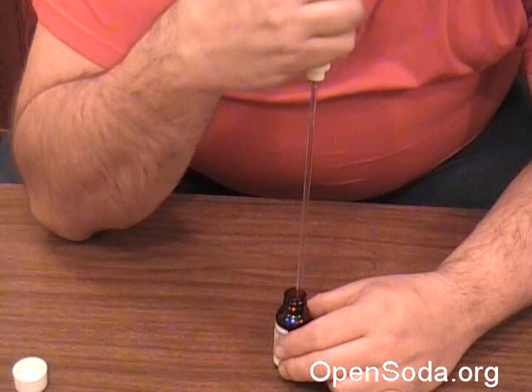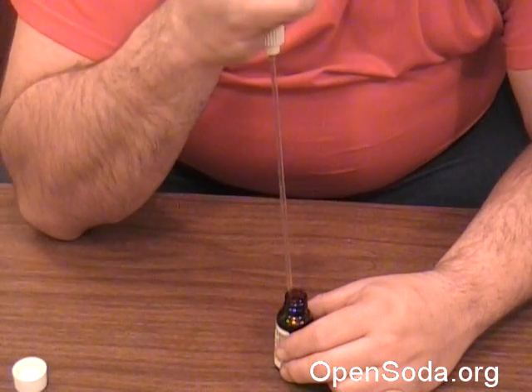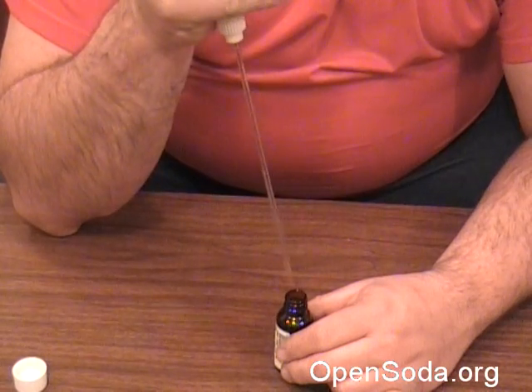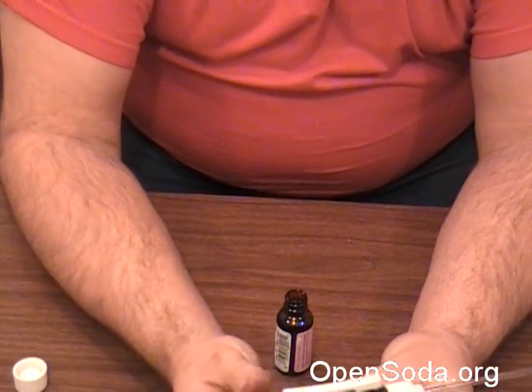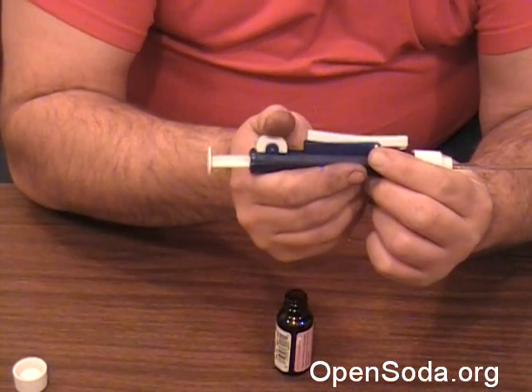It also has a quick release on the side here — that just releases the whole thing. You just press this in and roll this back and forth, and that goes in and out. It's just so smooth.